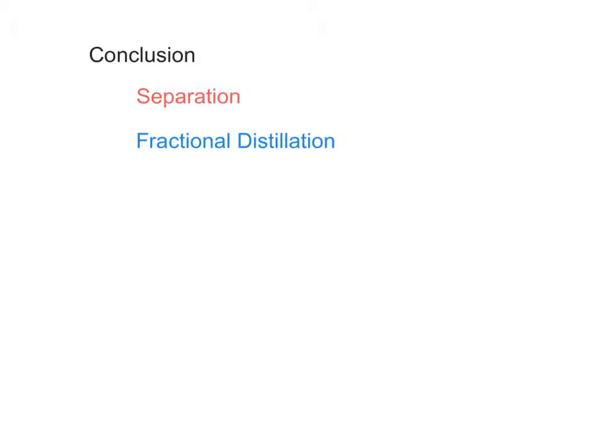This was only possible because alcohol, more specifically ethanol, and water have different boiling points, which was explained earlier as due to their polarities being different. But still, there is a limit to the purity of the distillation, as we have explained earlier.